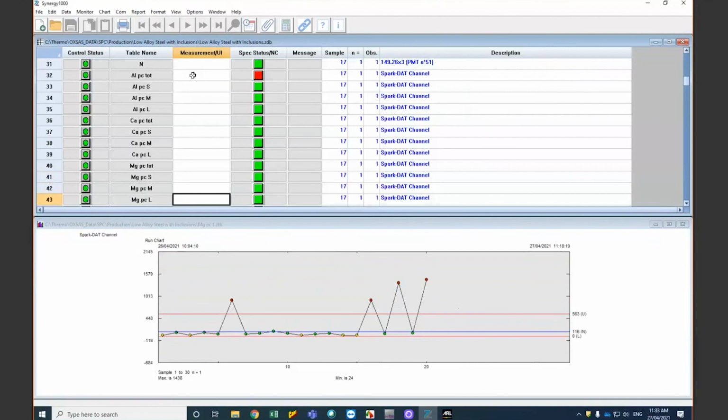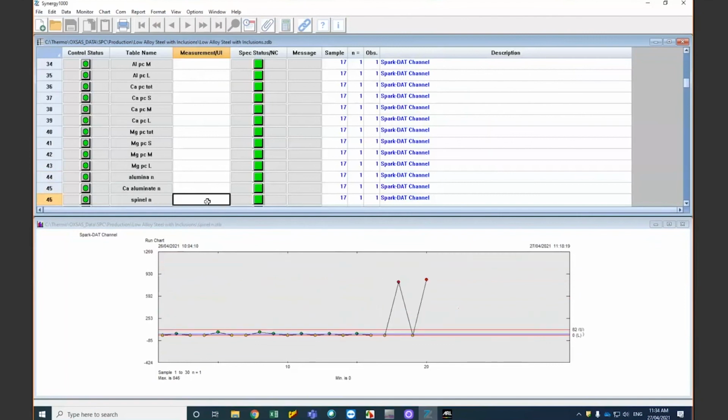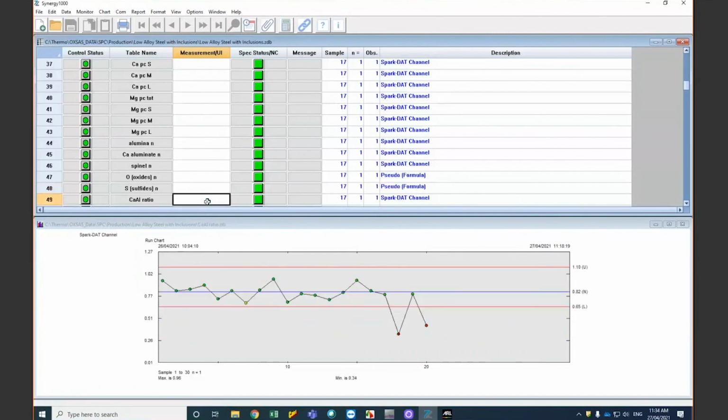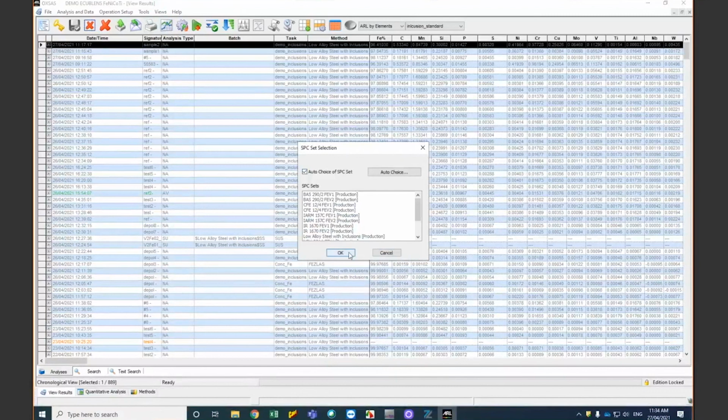Okay. Here you have the control limit which I set before. With this one, it's easy for you to monitor the trend of your sample to see if it is within the limit or not. If you don't have that sent by default, you can still manually send it.